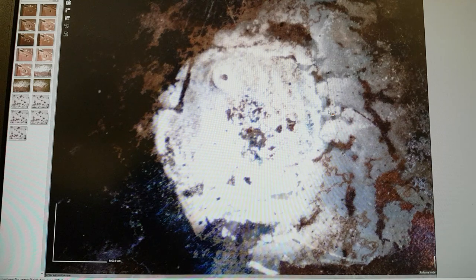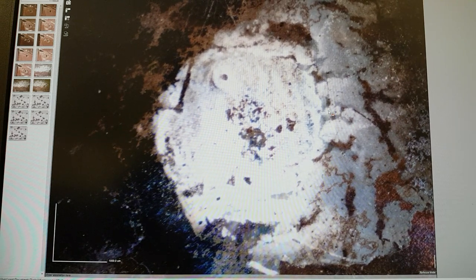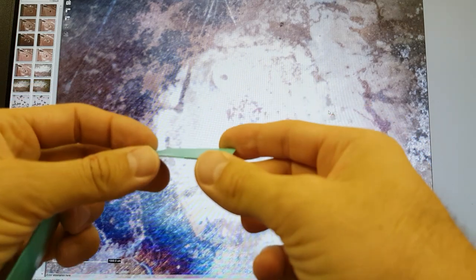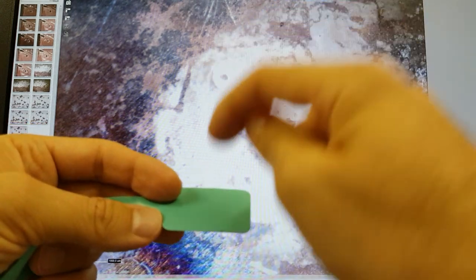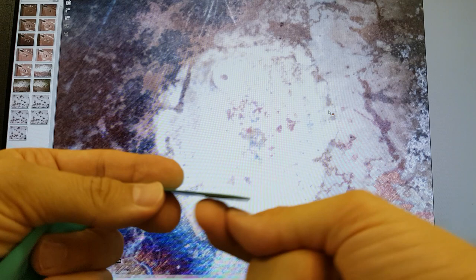This would explain why, potentially, in some cold fusion experiments you simply do not see elements that you would normally see — you don't get all of the lines, and sometimes the lines aren't where they should be, making it difficult to determine the elements. This sample I'm looking at here is a stainless steel 304 sample. They put it so that it was touching water and were doing the Amazagas discharges on the top surface, so it was effectively cooled underwater.